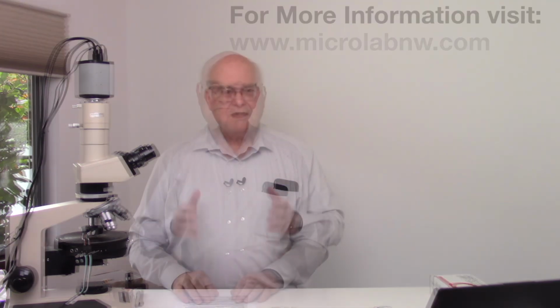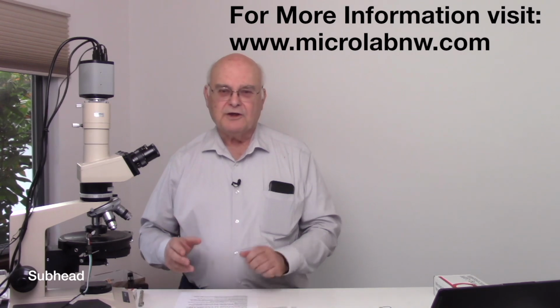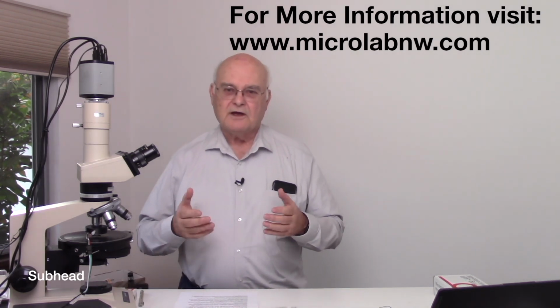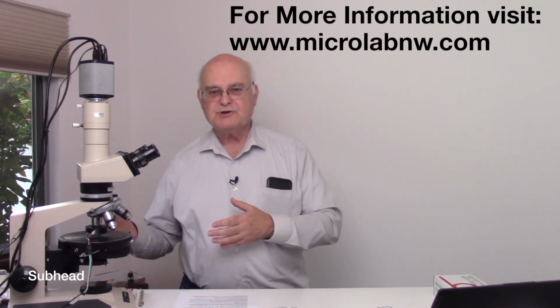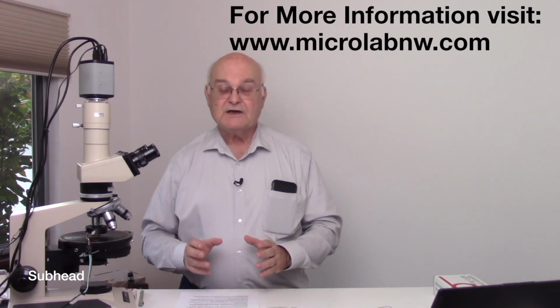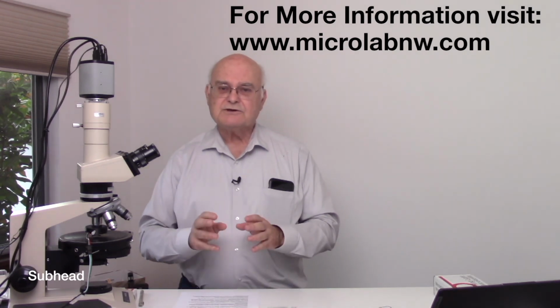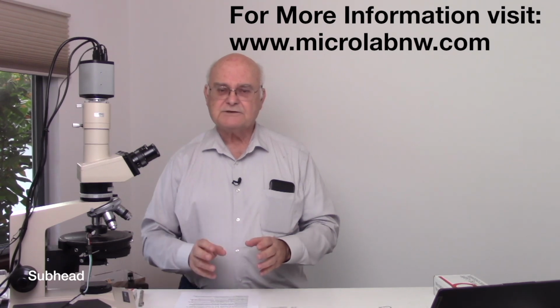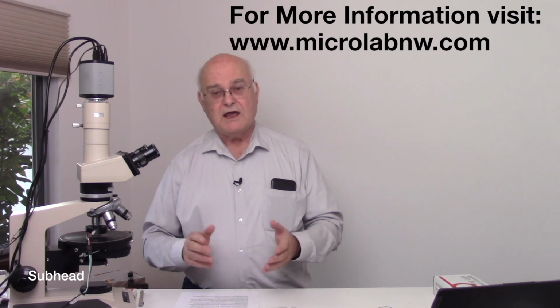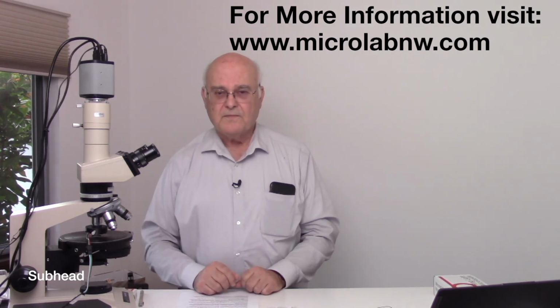So long for now. As a postscript, we are making available a number of standard slides. We're looking at grasses, trees, bark, leaves that have been ashed, as well as some that have not been ashed, so that you can see the structure of these phytoliths prior to exposure to fire and then after exposure to fire.